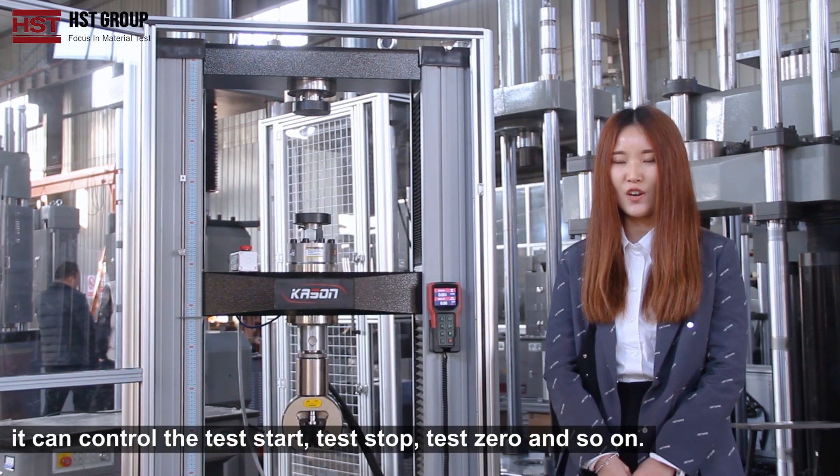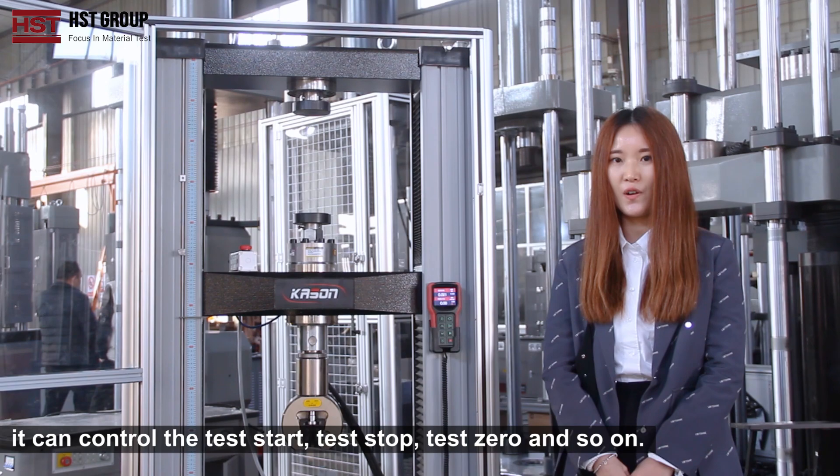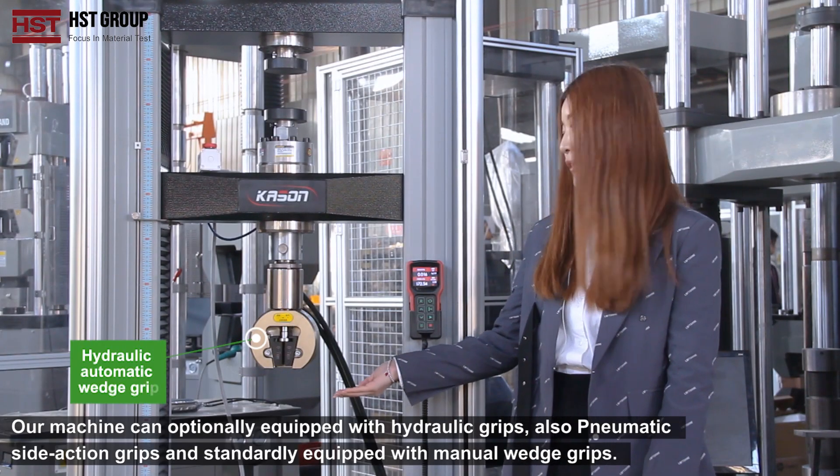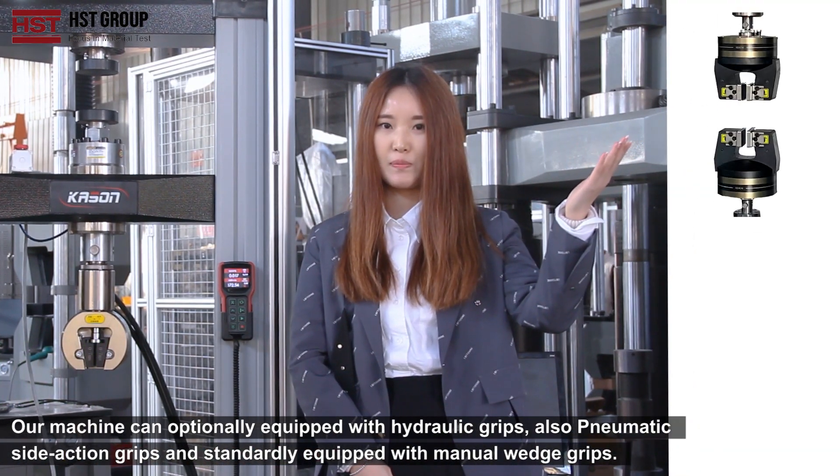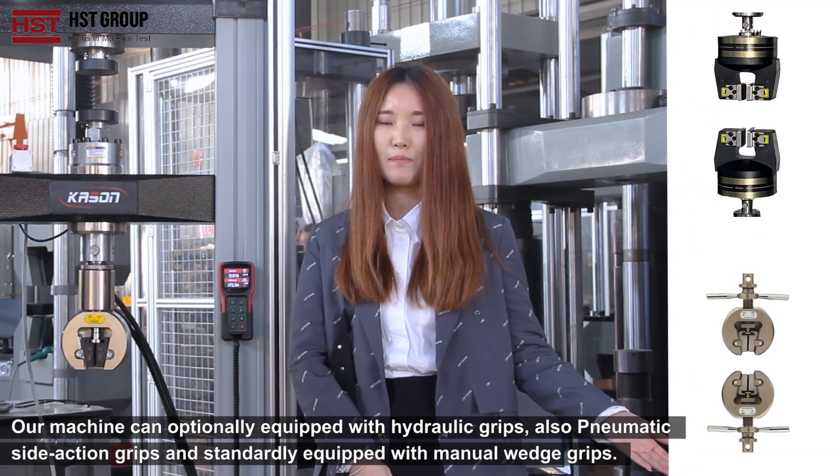It can control the test start, test stop, test zero and so on. Our machine can optionally be equipped with hydraulic grips, also pneumatic side action grips, and is standardly equipped with the manual wedge grip.